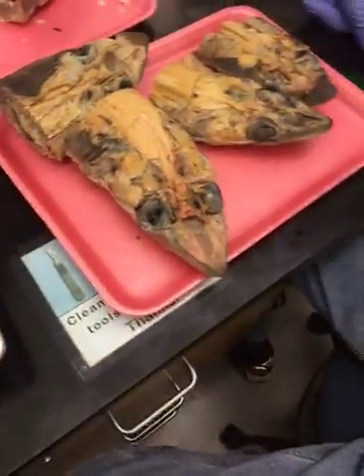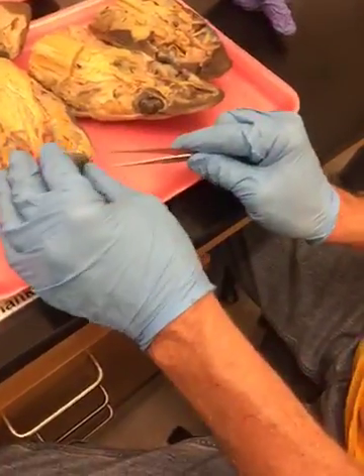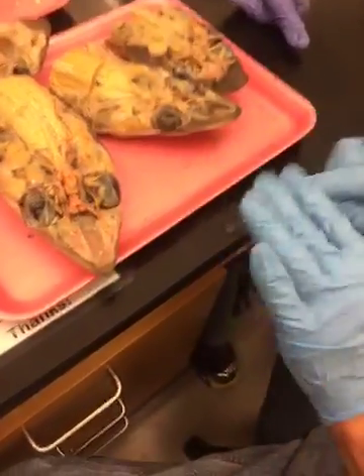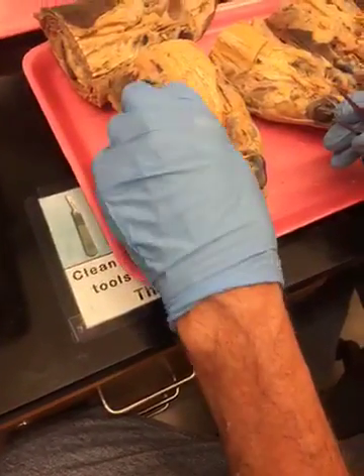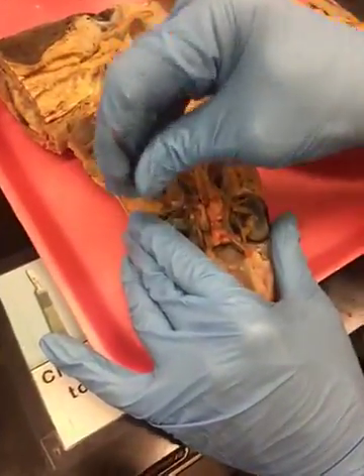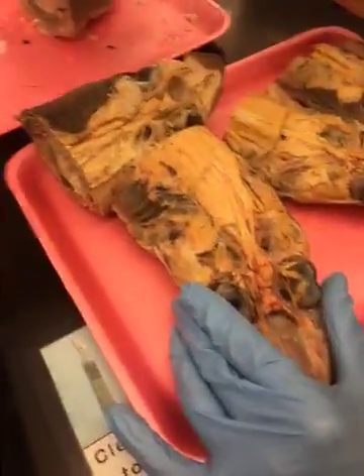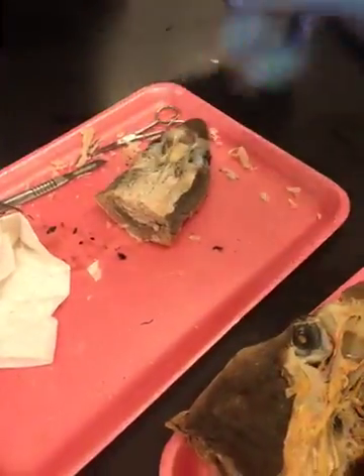Now, one remaining branch of 7, because we've already done the superficial ophthalmic branch of 7, and we already did the buccal branch of 7. There's a remaining branch that goes back behind this half gill called the spiracle. That opening is called the spiracle. There it is on yours. There. Must be on yours somewhere around here. There it is on yours.